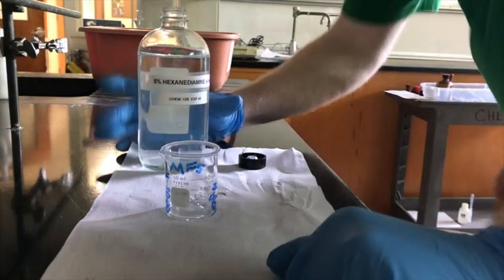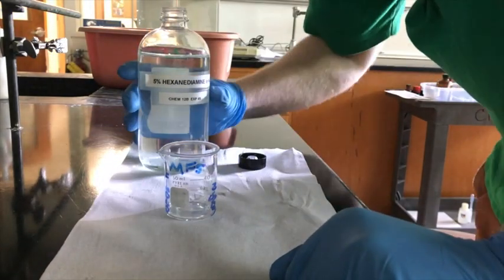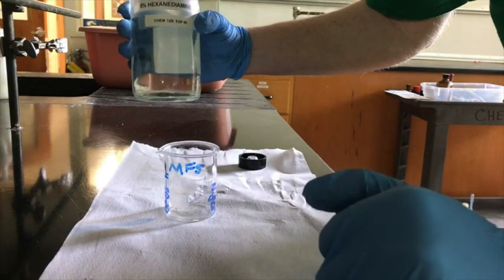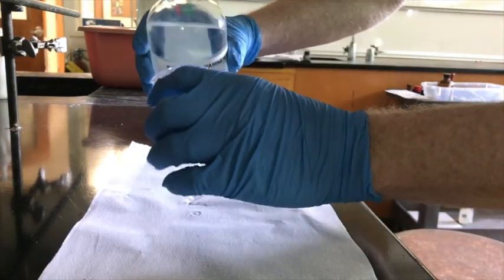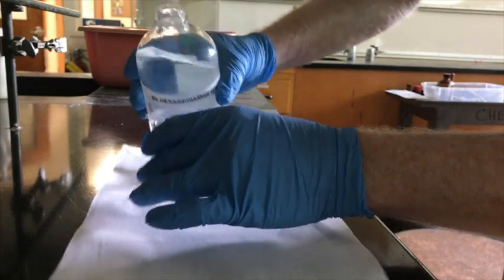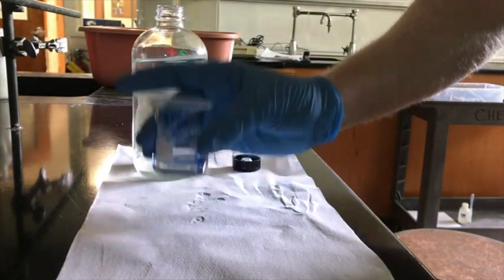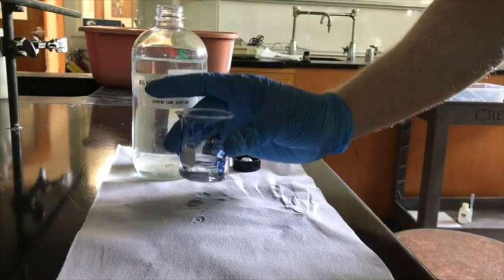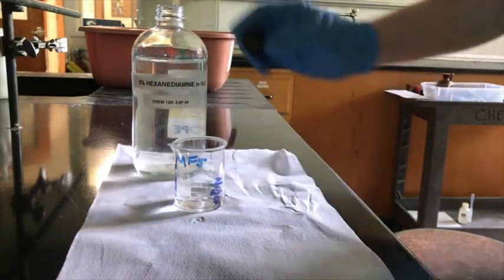Okay. Hello. First, we'll add the 5% hexane diamine in water, about 10 milliliters. Let's see if we can get that. I'm cheating a little bit. This is going to be a performance enhanced nylon synthesis. Okay, so I got that there.